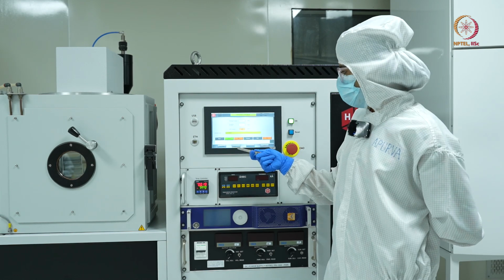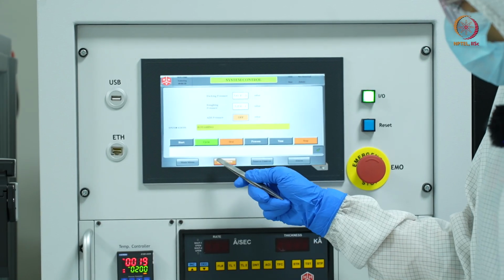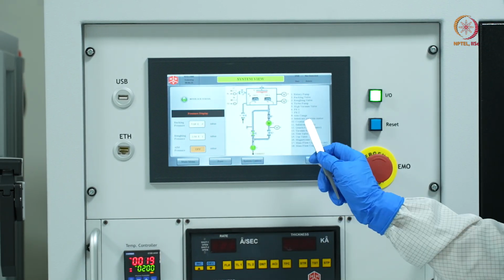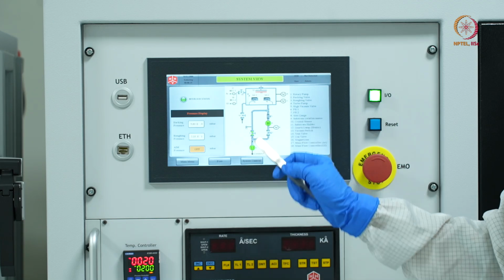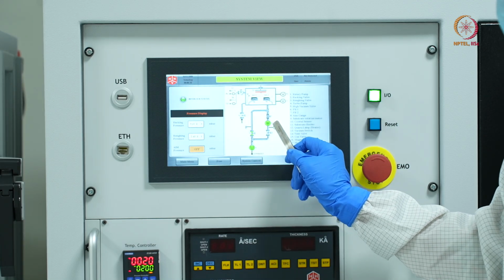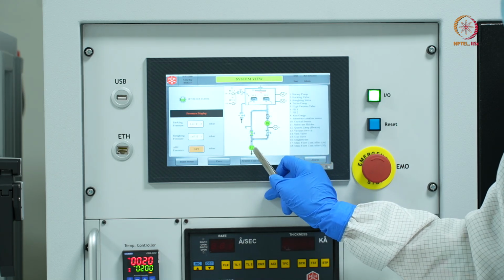To get a closer look at the details of the pumps and the valves, I'll go to the system view, and here is a mimic diagram of the whole system. This is the chamber, and these two things are the magnetrons, and there are two lines going, one through the turbo pump, and one directly connected to the rotary pump.